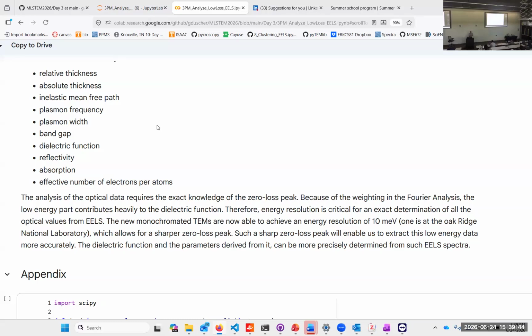So we have the dielectric functions that we get directly from our fit, but only for higher energies. That is something you do not get with light, because the energies are just too high. They have a different energy range. But if you have a good monochromator, you can get to this range as well.